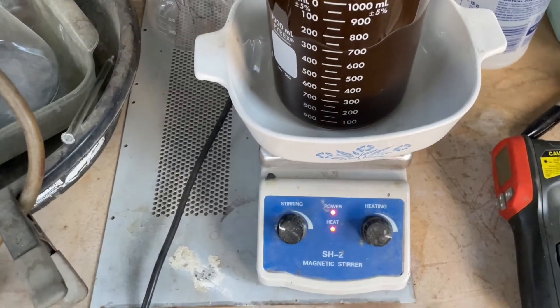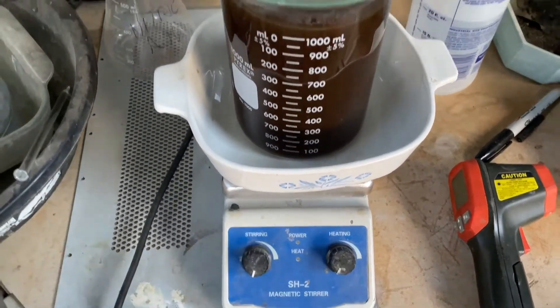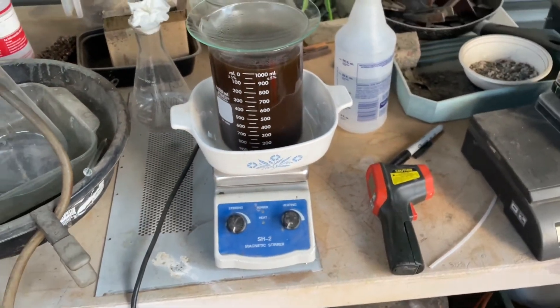That's fun. That's really cool. Alright, off with the spinning. Down with the heat. Boom. There we have it.